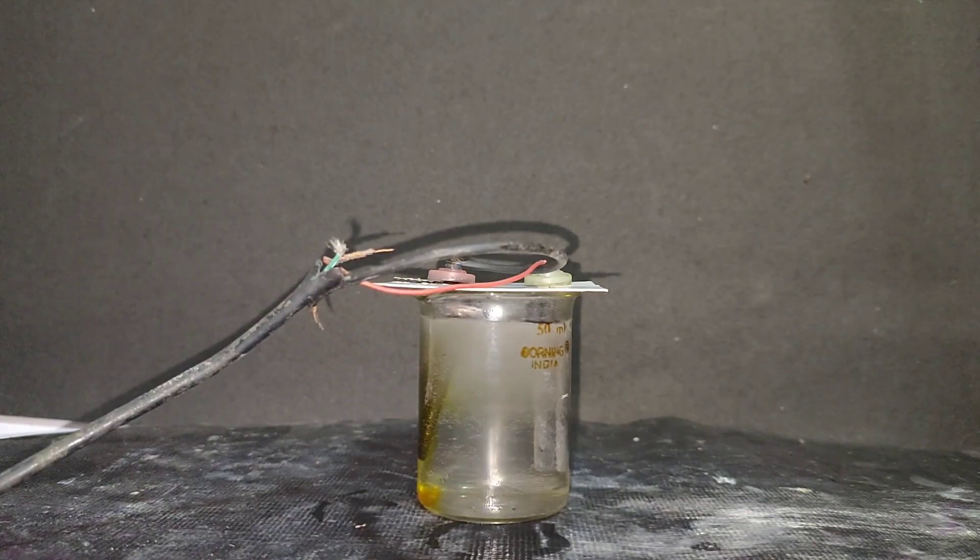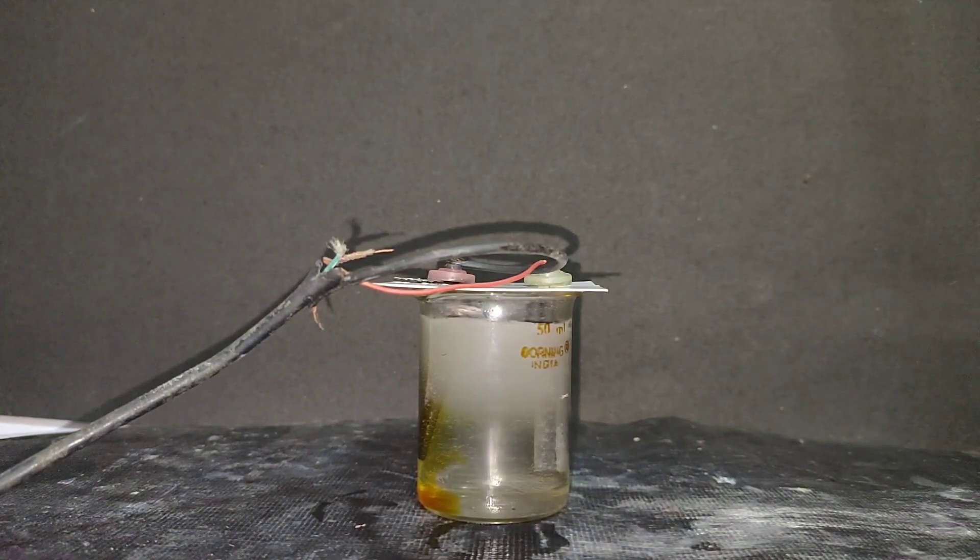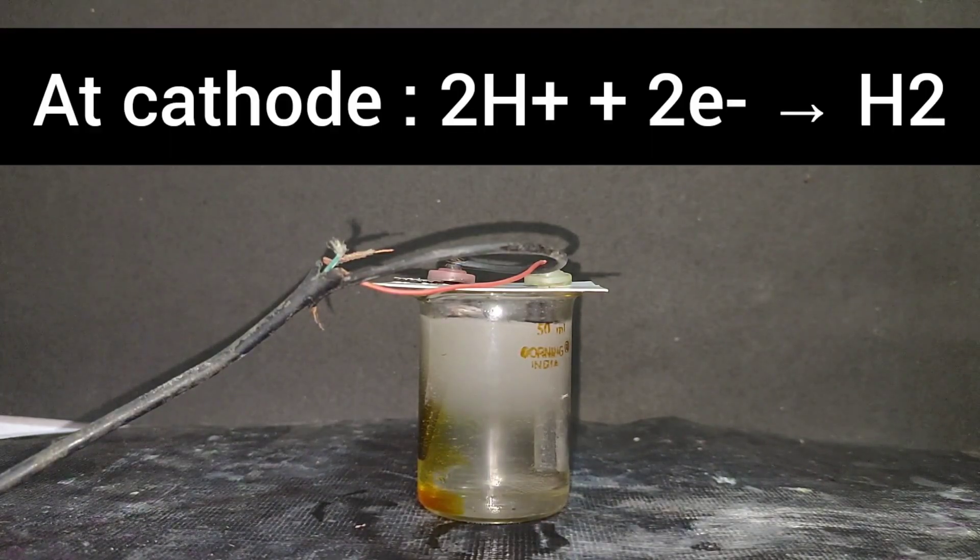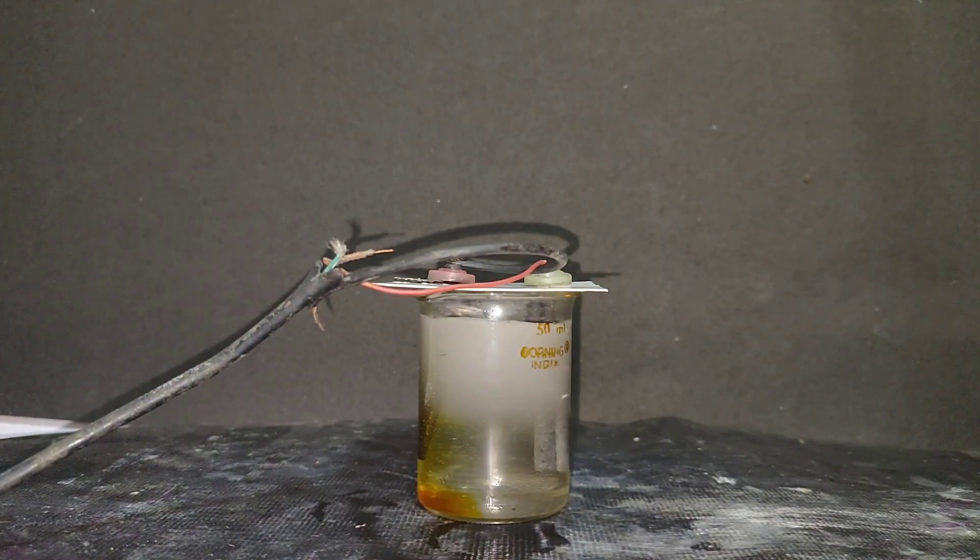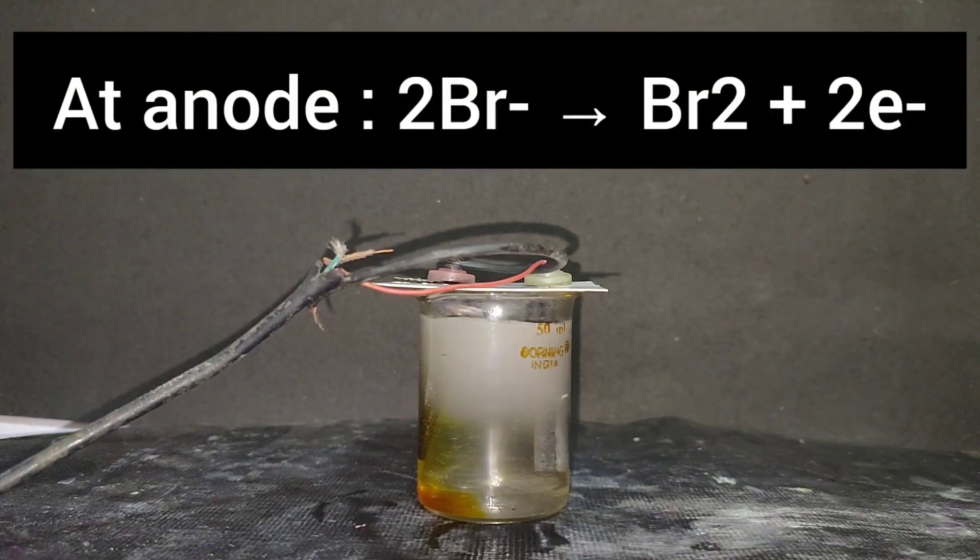What is happening here is there are four kinds of ions in this solution: potassium ions, bromide ions, hydroxide ions and H plus ions. So due to low reduction potential of H plus ions, the H plus ions are getting reduced on the cathode and on the anode.